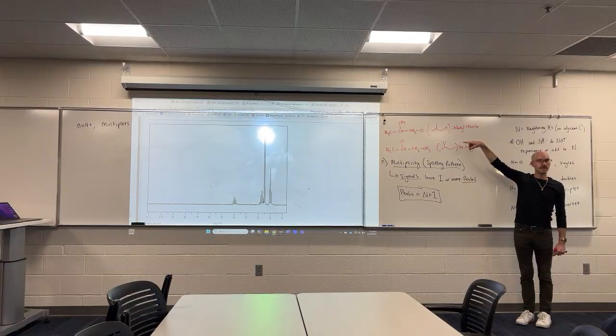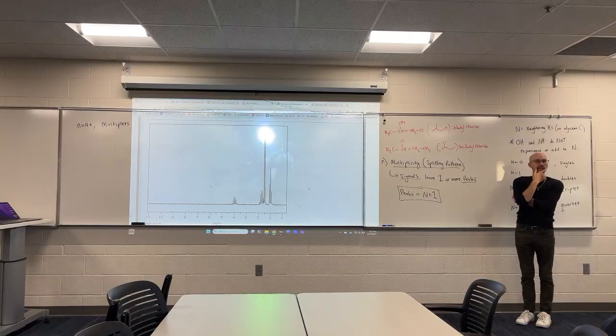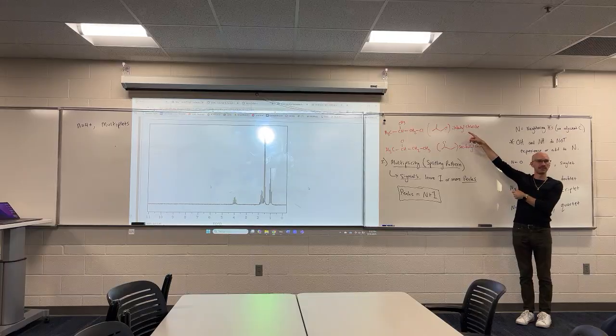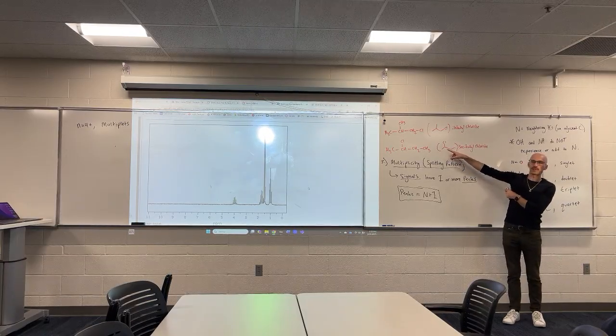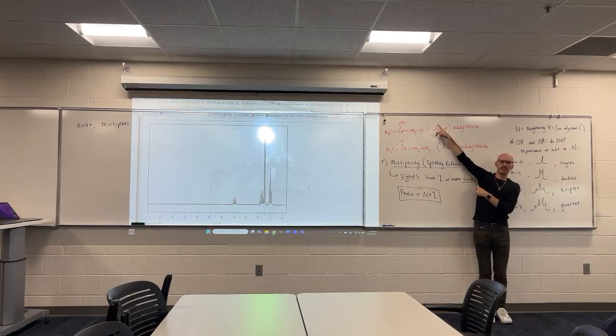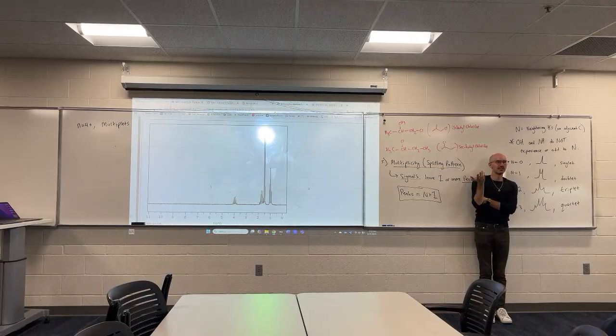Yeah. And actually, I guess you probably could have argued that it was never going to be this one anyways. Because we knew that we had two different CH3 groups. But those two CH3 groups, they're actually identical to each other. They're not different.